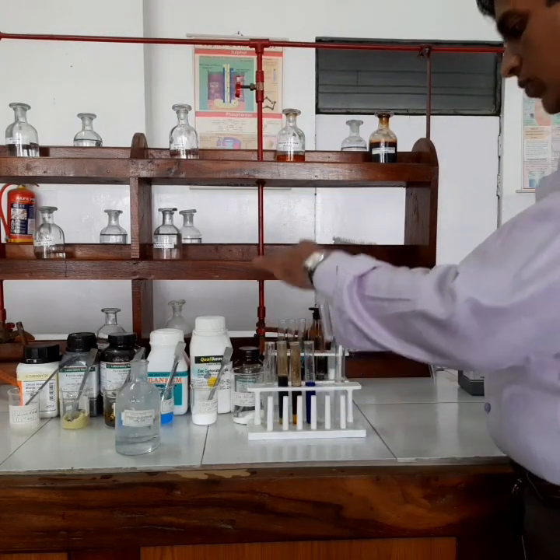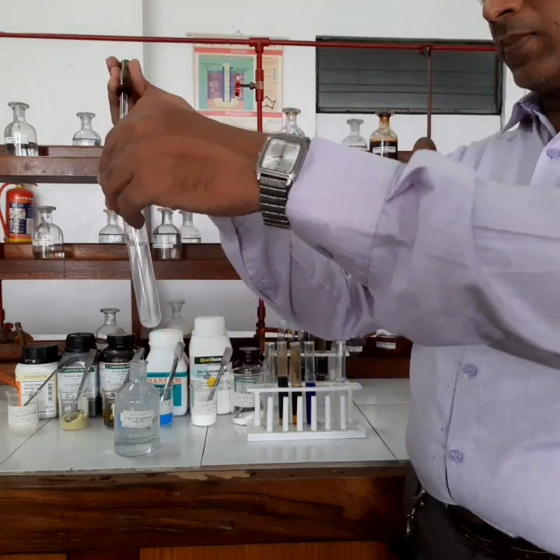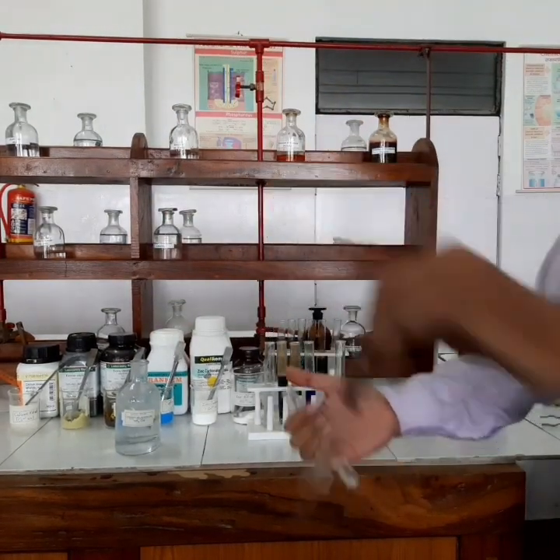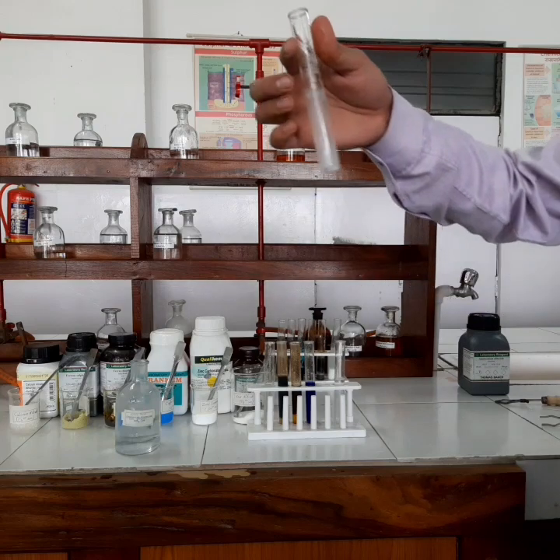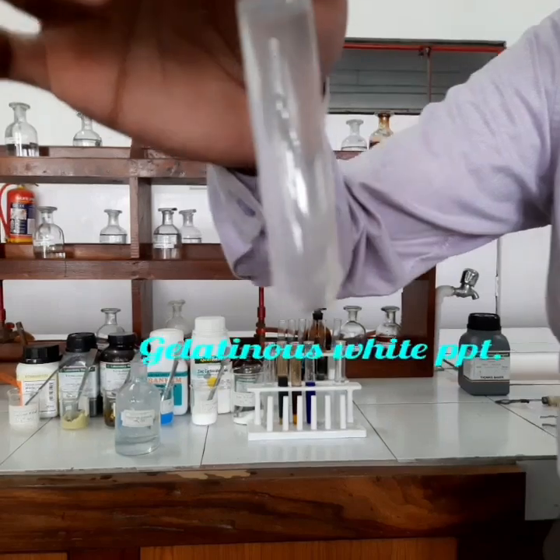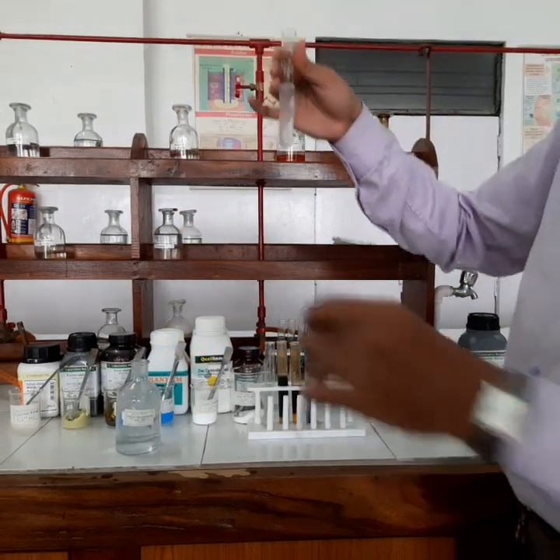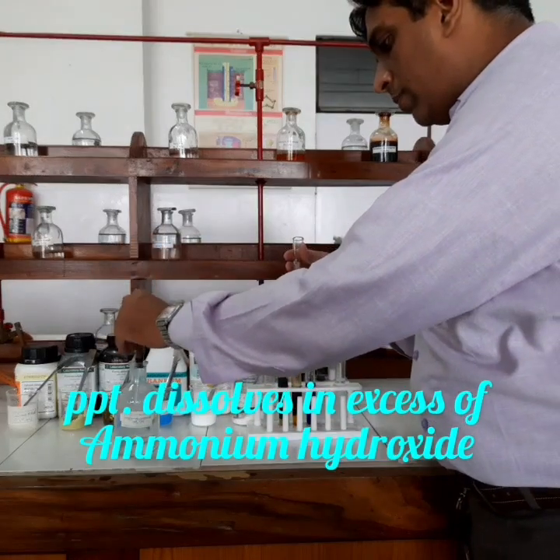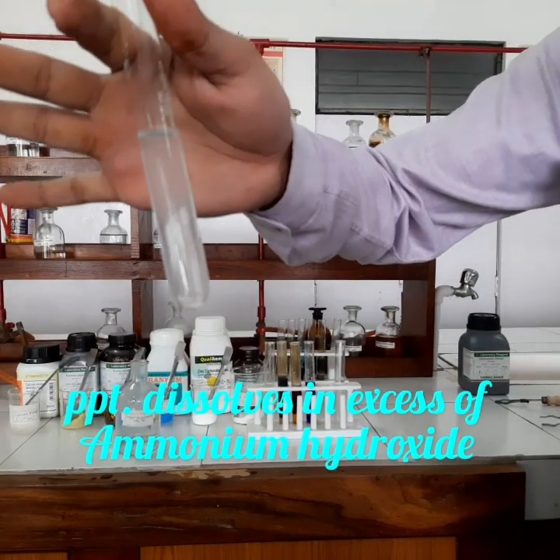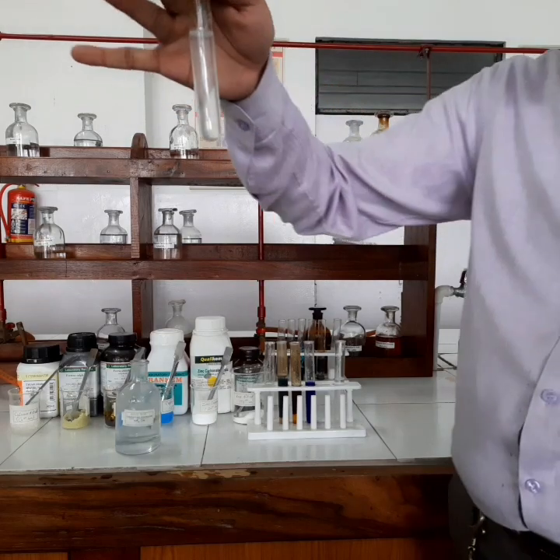Now coming to the salt of zinc, again zinc is also going to make a difference. Why? Let's see. On adding ammonium hydroxide in limited quantity to the zinc, first of all, we are going to get a gelatinous white precipitate. As you can see, a small gelatinous white precipitate is formed. The solution has turned milky, but this milkiness will disappear in excess of ammonium hydroxide. The solution will become completely soluble and completely colorless. Now you can see that the precipitate is dissolving and it is becoming completely colorless.